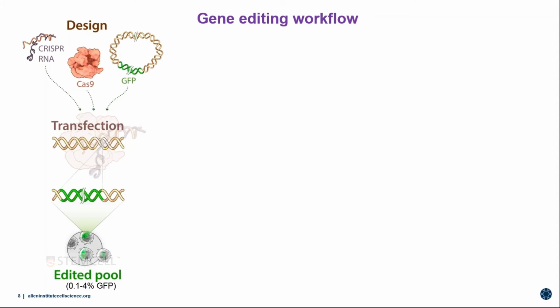So this, of course, relies on your gene of interest being expressed, right? Because this requires an enrichment. But you can imagine doing drug selection or any other selection that works for your project to achieve the same result. Our genes are definitely expressed, so we go this route, but we are currently working on methods that would allow for enrichment of non-expressed genes, and we hope to share that with the community in a few months.